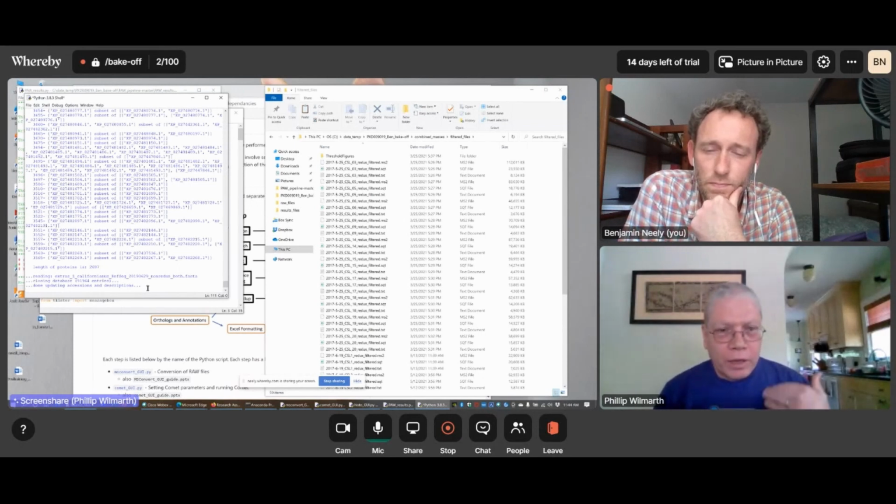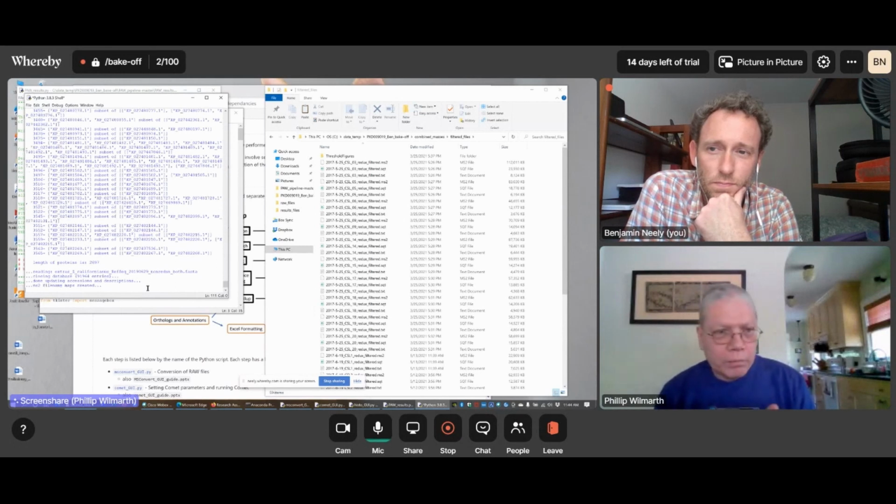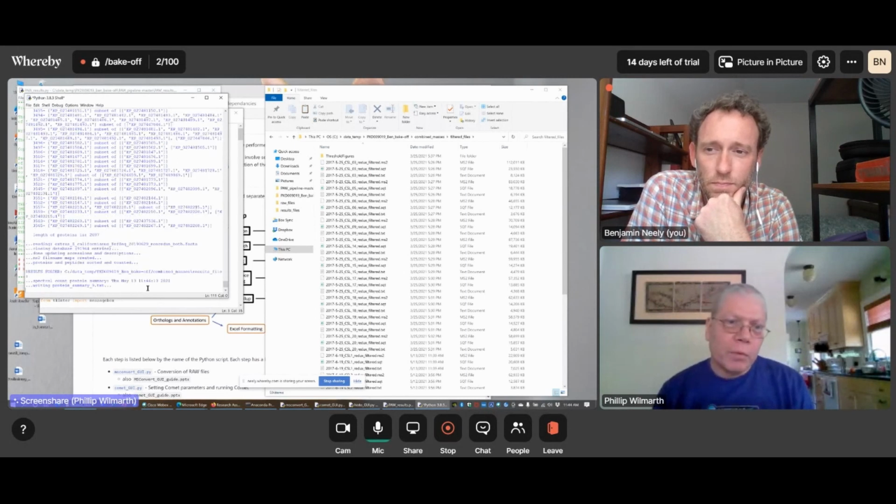And we put out a very detailed report that matches each raw file name. That's got all of the common search score information and mass information in it. Then we make a peptide and protein summary file where we collapse things more at the sequence level, that the biologist is going to be a little bit more interested in.